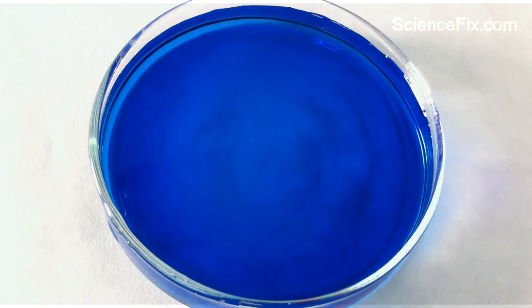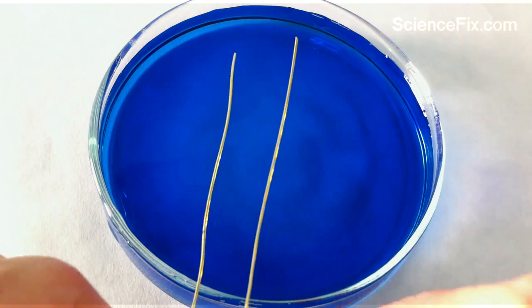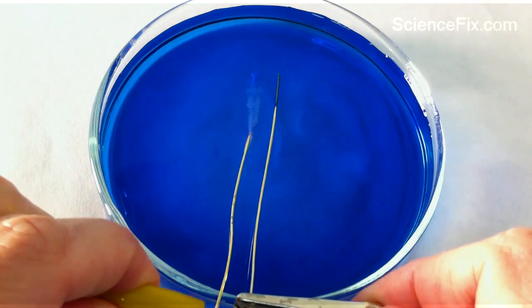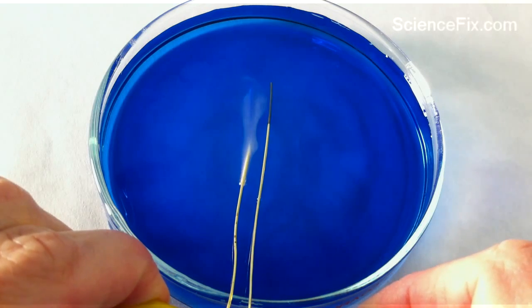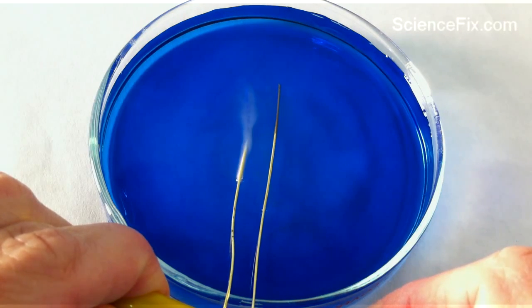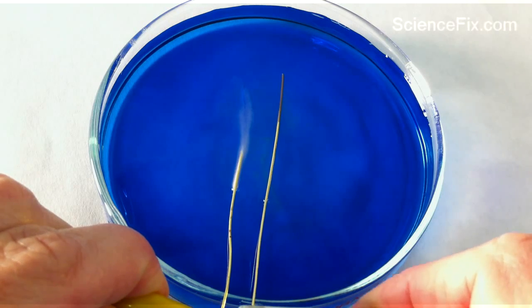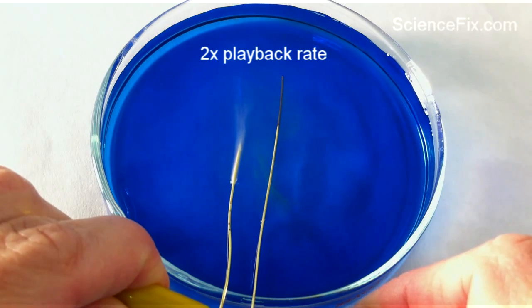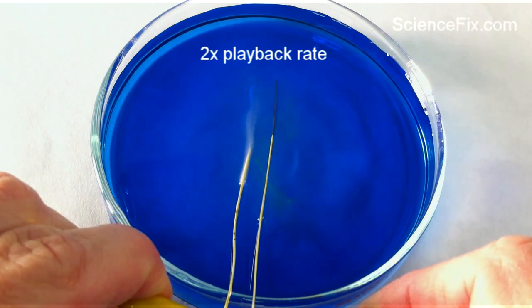Then you put the two wires into a solution of bromethymol blue, and the bromethymol blue solution also has some salt so you can get the electricity flowing through the water much easier. You can see electricity is flowing between the two wires and you have bubbles forming - that's the oxygen and hydrogen gas forming.